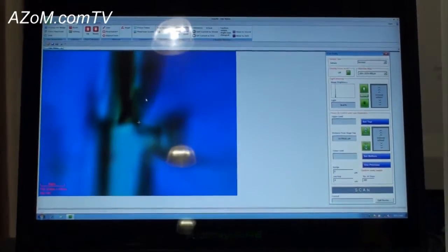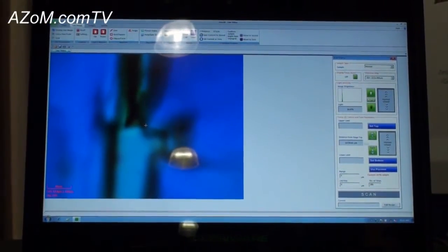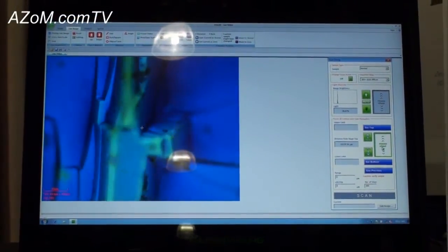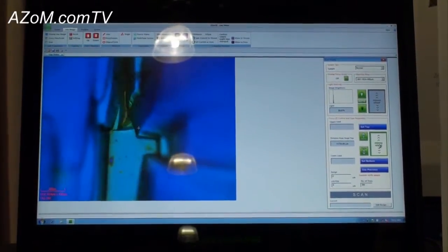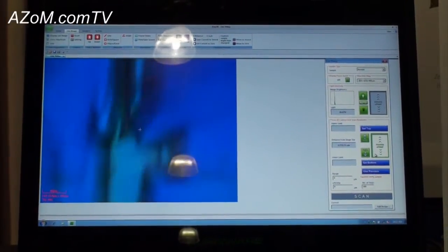If I go to even higher magnification, one can easily see as I adjust the focus there are many planes, or there's a huge depth of focus over the sample Z range.